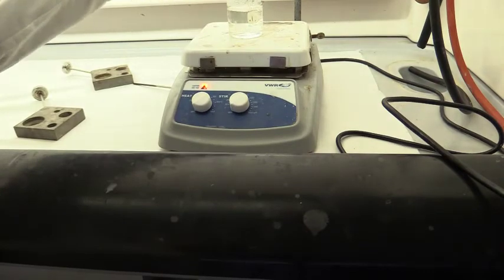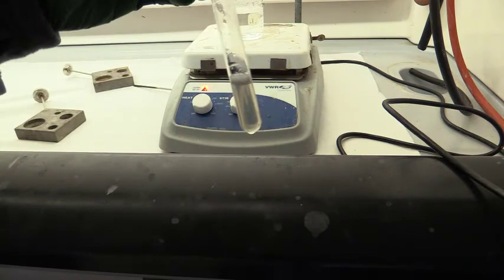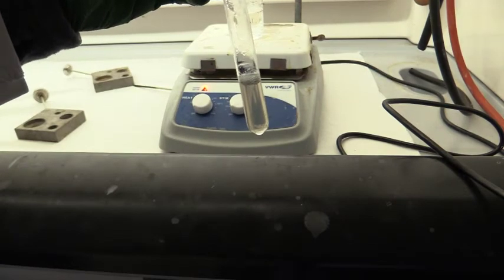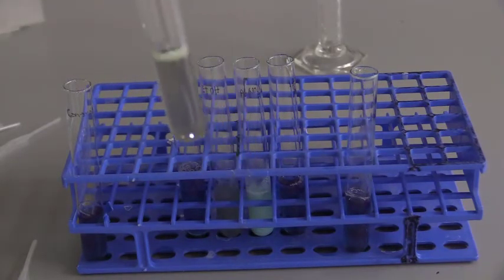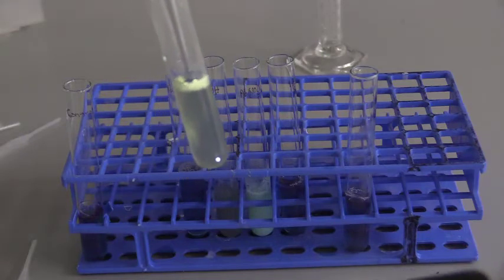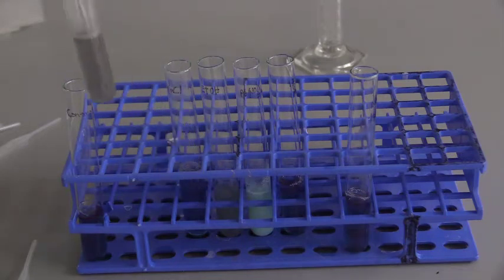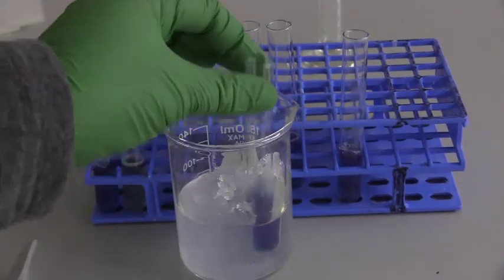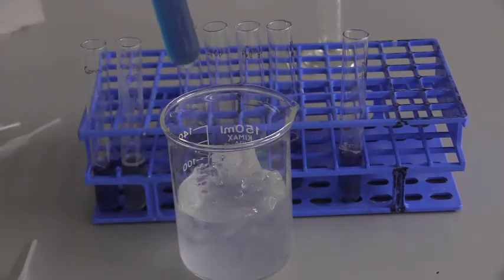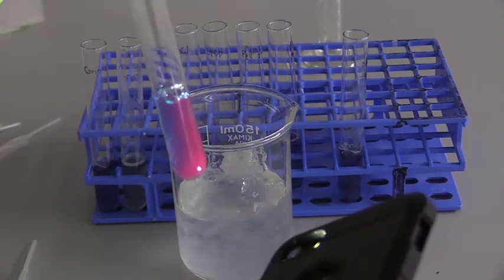So I'm going to check my hot sample. This looks very different. You can record your observations in your table, and we'll shine the light on that so you can see what that looks like. Now we can check on our cold sample in the ice. Notice the solution color and when we shine the light on it.